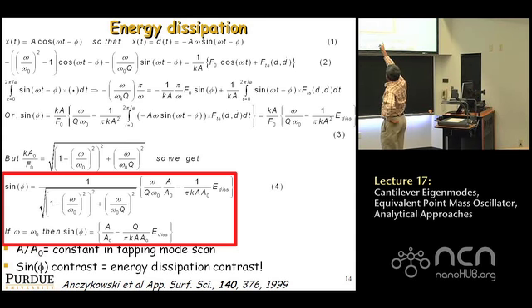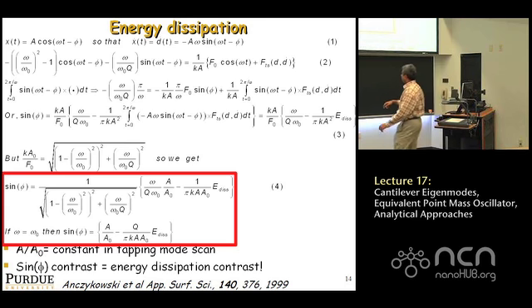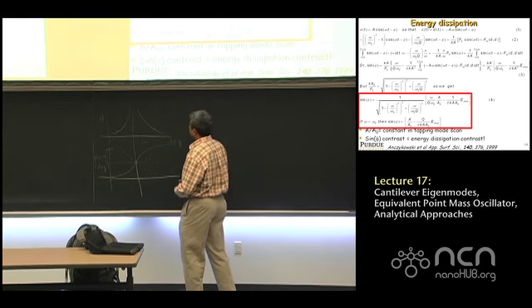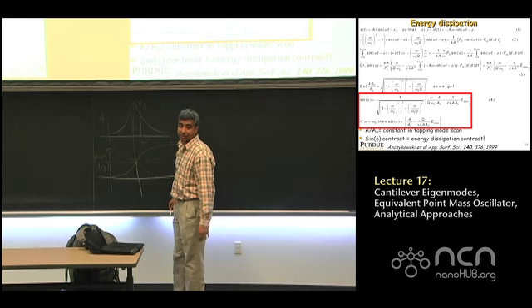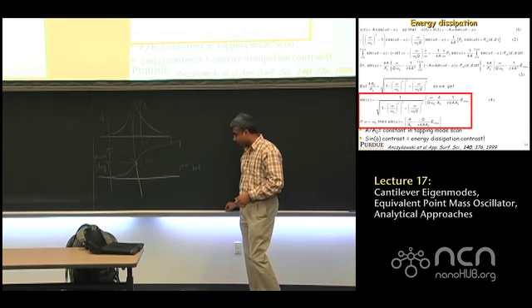So we're at equation 3. Now, we make use of a relationship that we had from before. What is the driving force F0? How do you know what the driving force F0 is? Well, you've done a tuning curve, right? So you know the tuning curve, and you've chosen to drive it at resonance with an initial amplitude A0. A0 is the initial amplitude, or sometimes people call it free amplitude.